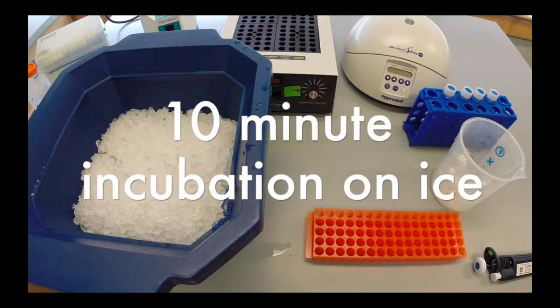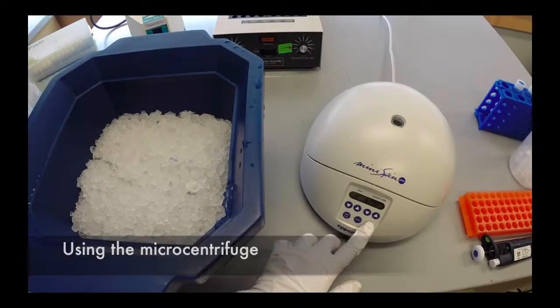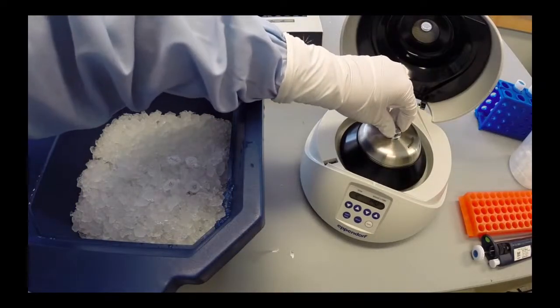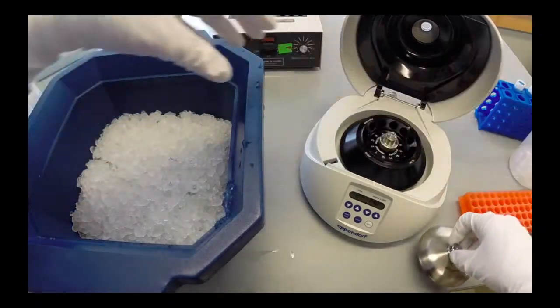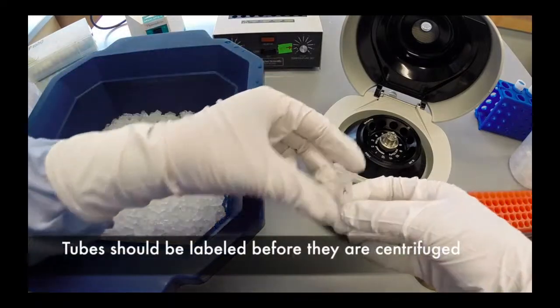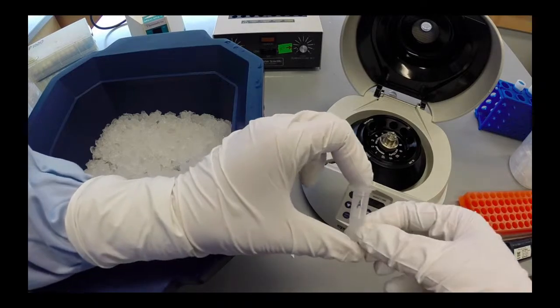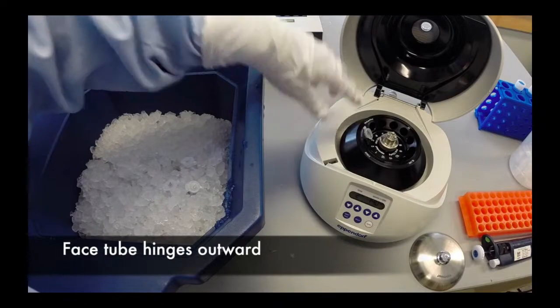Impurities in the solution will be removed by centrifugation. After flipping the switch in the back of the microcentrifuge, press the open button. Remove the metal lid inside by pulling on the knob. Make sure that the tubes are labeled either with letters or numbers before loading them into the centrifuge. Load samples with hinges facing outward.